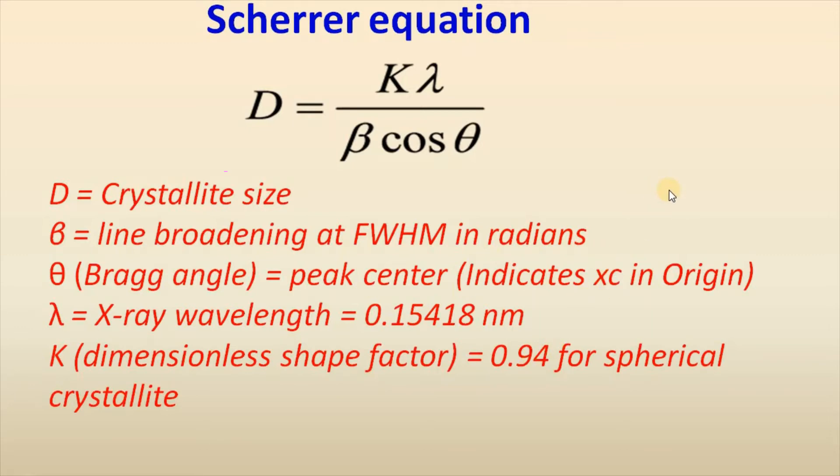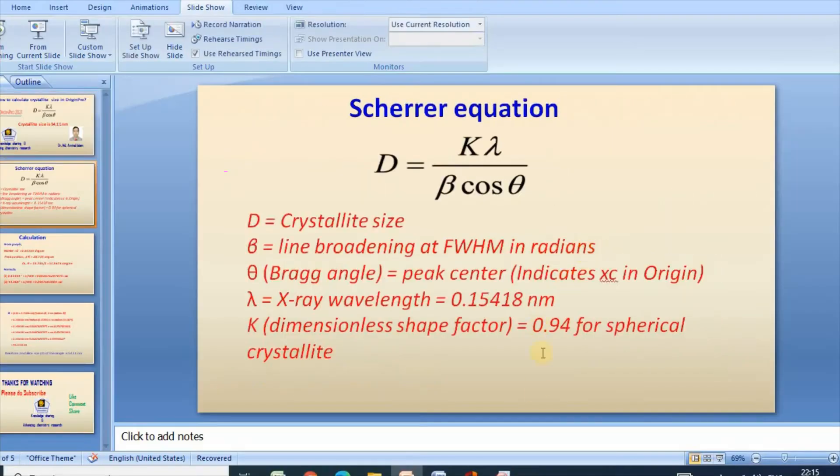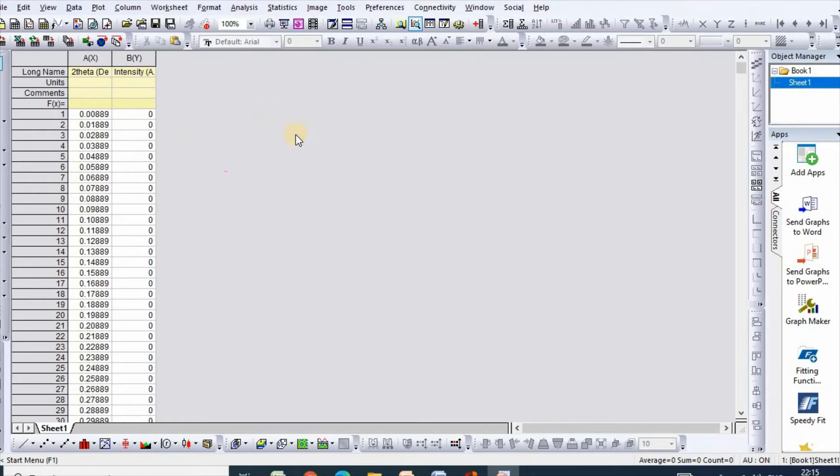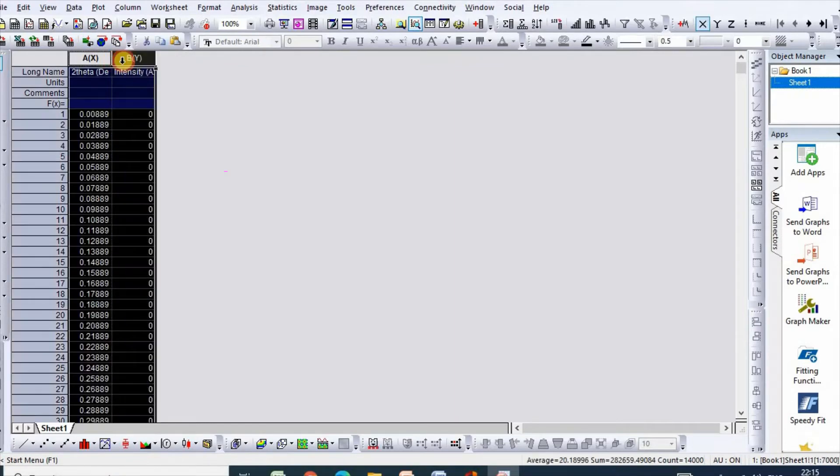In order to draw this I would like to take it to the Origin. In order to plot XRD graph I have taken my XRD data from Excel sheet to Origin. Here is my data. And it is mentionable that here X axis is twice theta in degree, whereas intensity is Y axis. It is arbitrary unit.